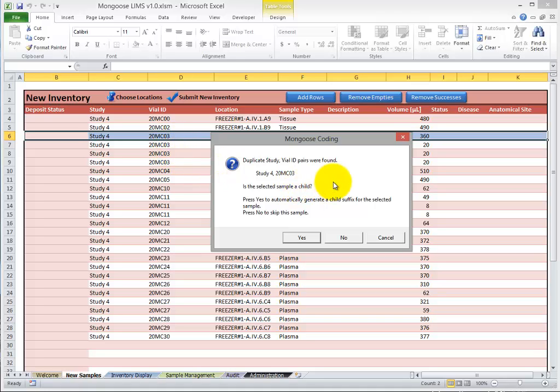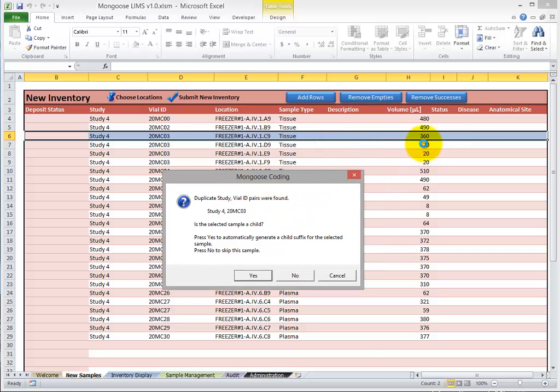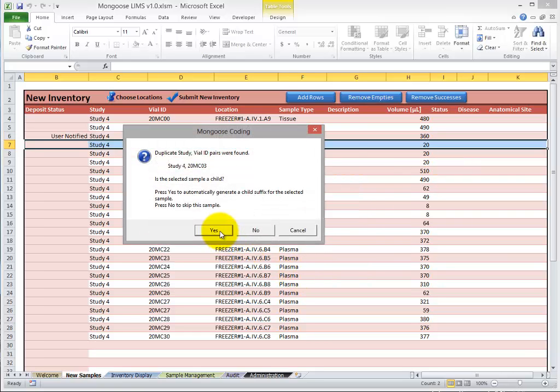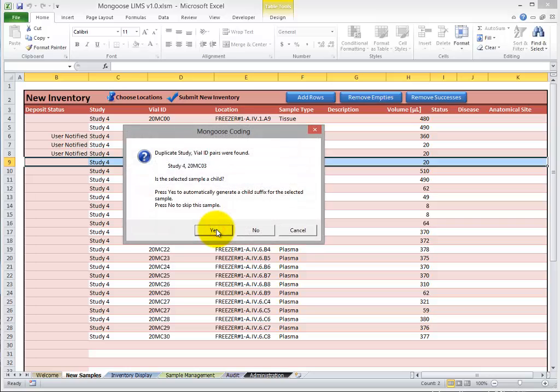So it's asking if the selected sample should be a child. If we click Yes, Mongoose Coding will automatically add the child suffix to the vial ID to ensure that the vial ID is unique. So let's look at the volumes over here. The selected sample has a larger volume. So let's assume that the smaller volume samples are the children. So we're going to click No on the first one. And we'll click Yes on these next three to make them children.